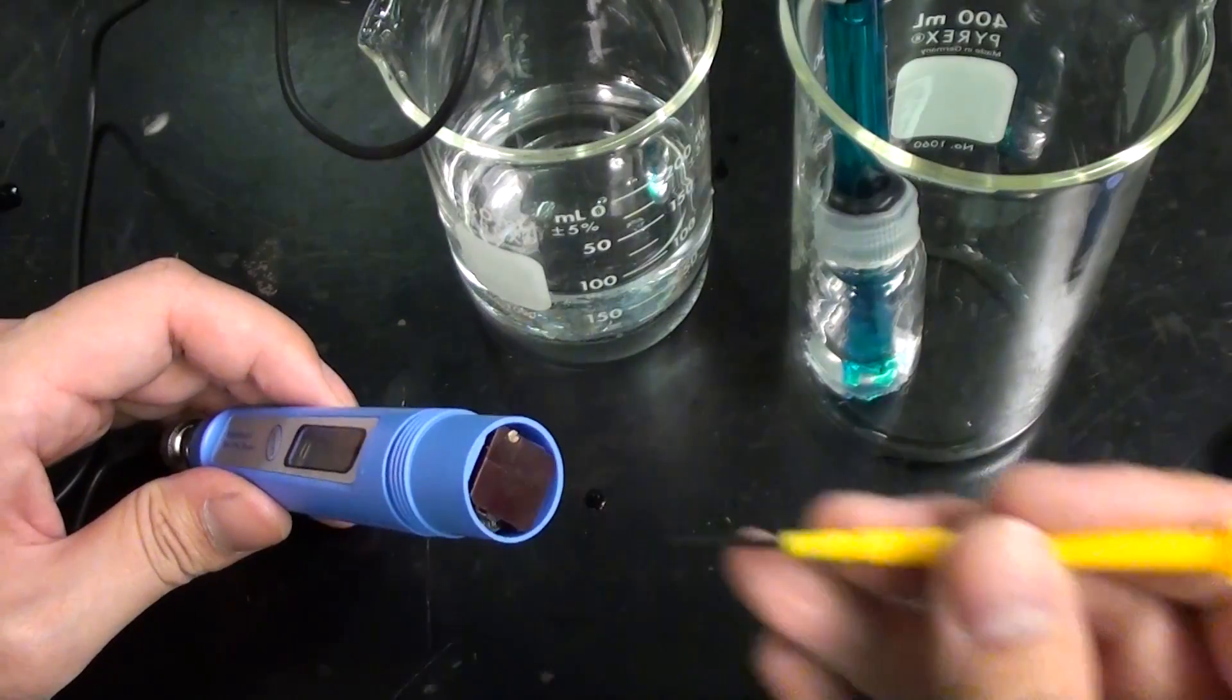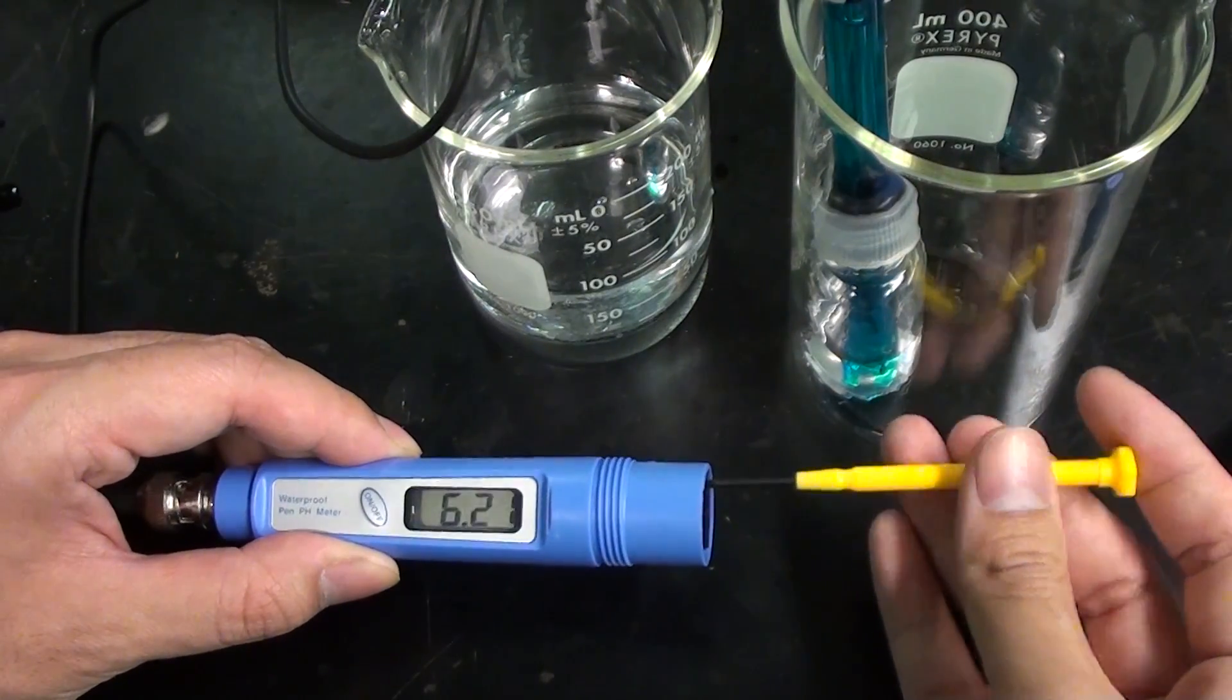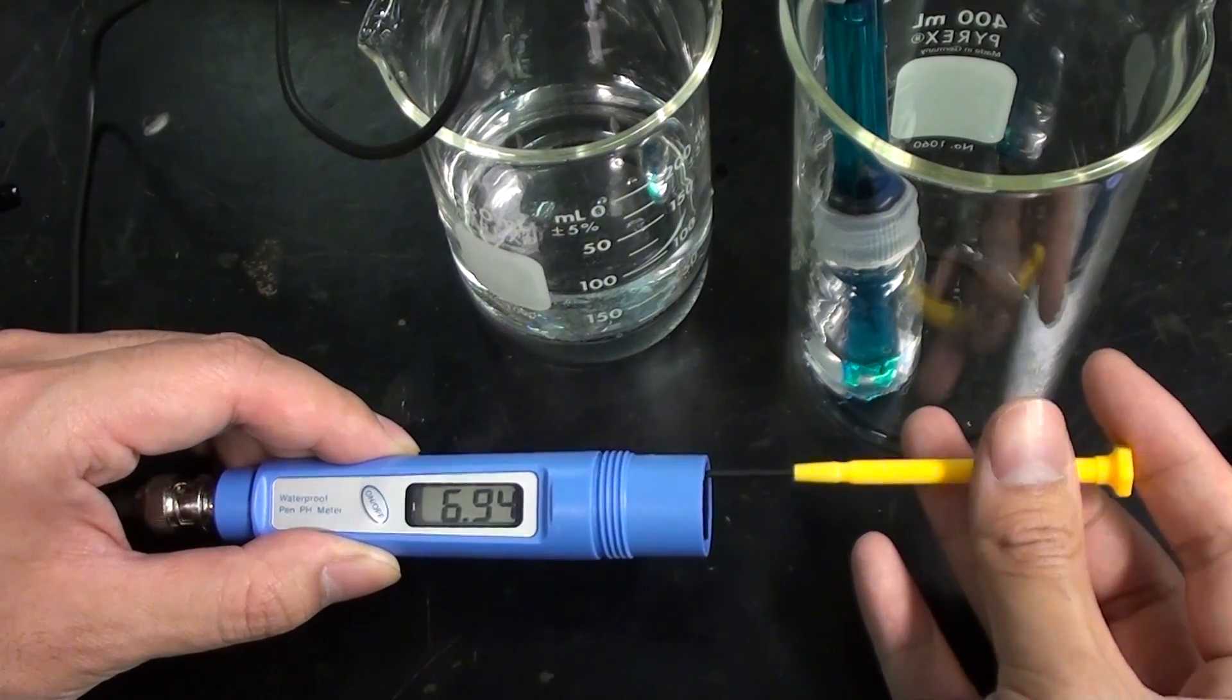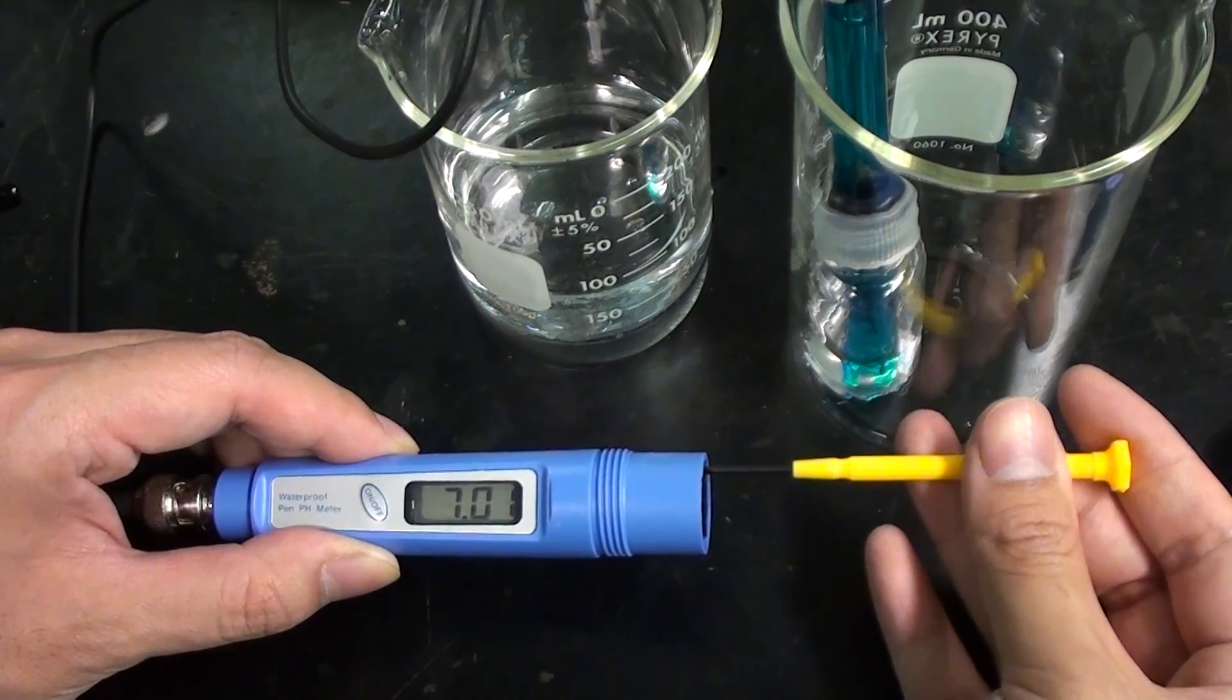Now a glass electrode can drift a lot in terms of reading, so even if you calibrate yesterday, it can drift to something different today. It's best to recalibrate before doing an experiment.